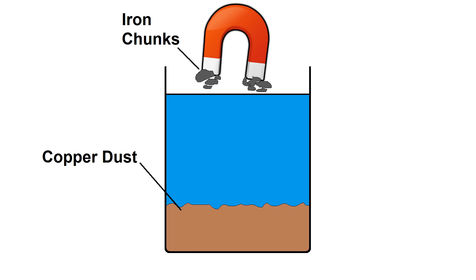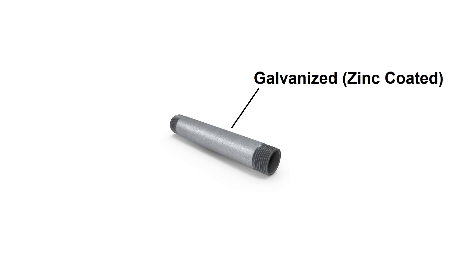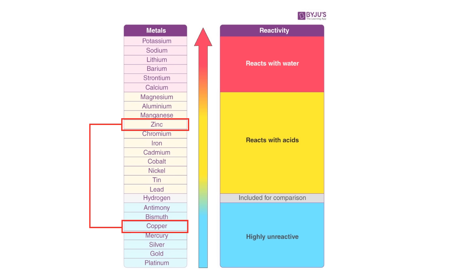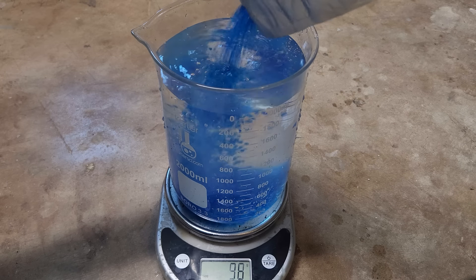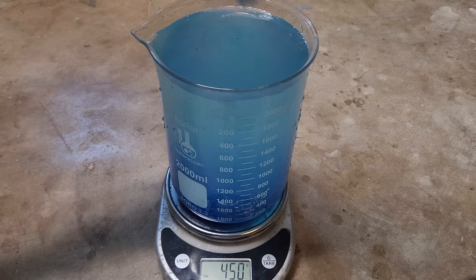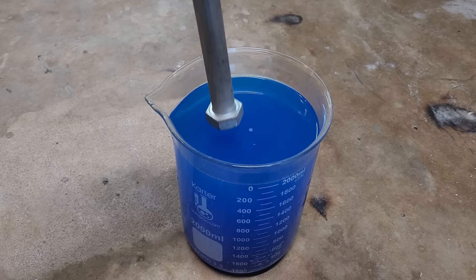Unless it oxidizes. I'm pretty sure galvanized steel should work too, since zinc is also more reactive than copper, so it'll just form zinc sulfate instead of iron sulfate if it reacts. I'll start by filling up a beaker with 2 liters of distilled water, then add 450 grams of copper sulfate. Then I found some steel I wasn't using and threw it in.